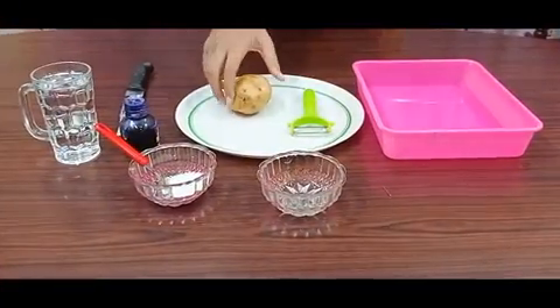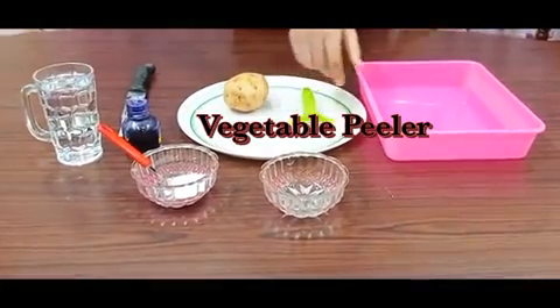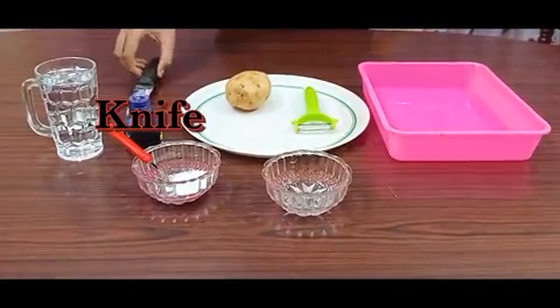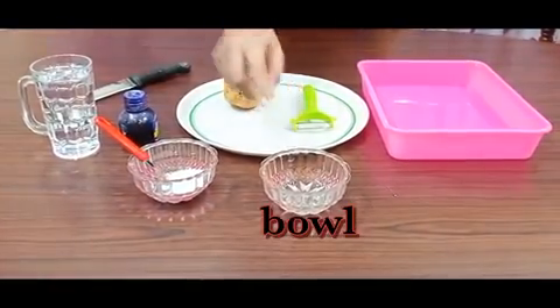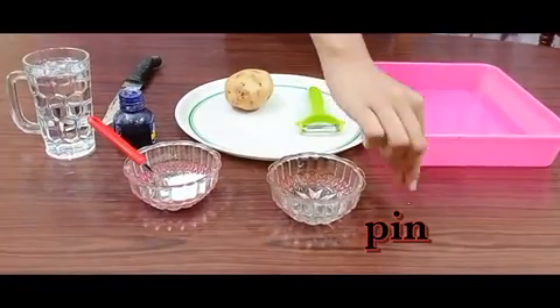For this experiment, we need a large size potato, a vegetable peeler, a plastic tray with some quantity of water, a knife, a bit of salt, ink, a bowl, a glass of water, and a pin.